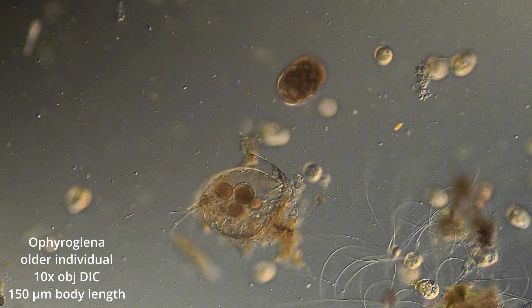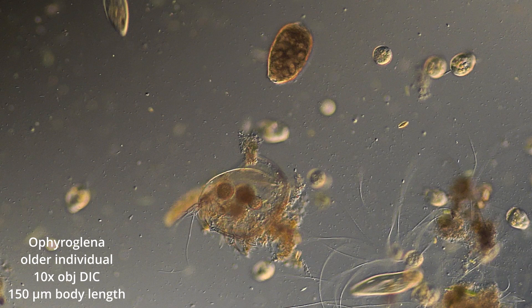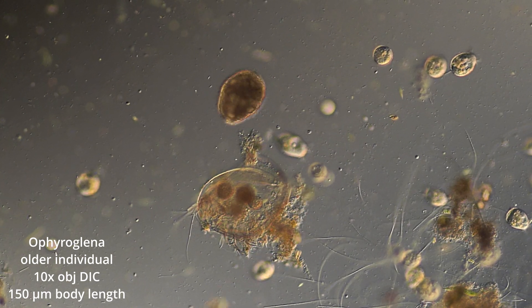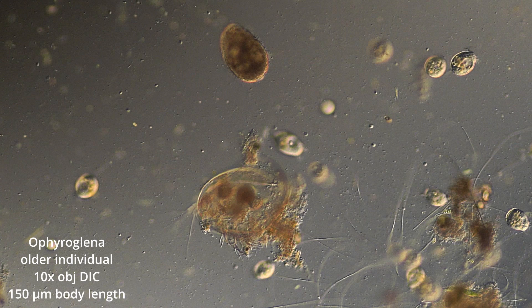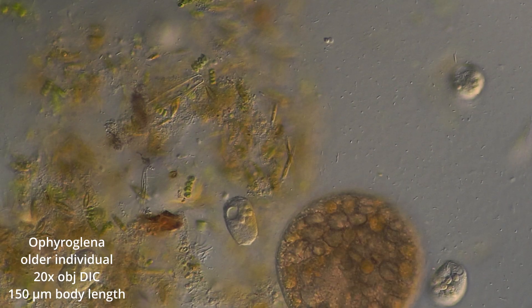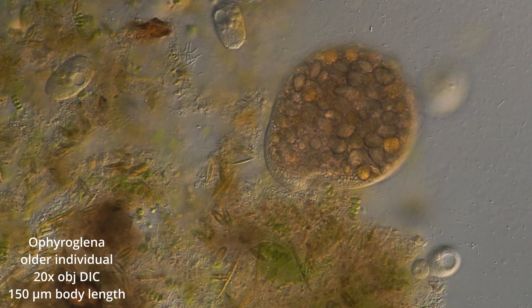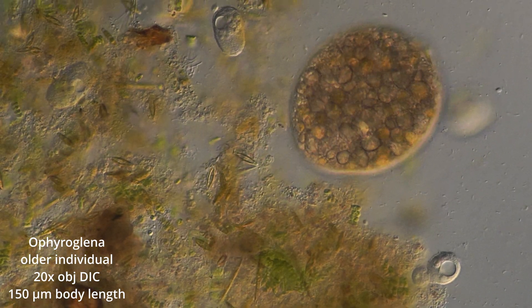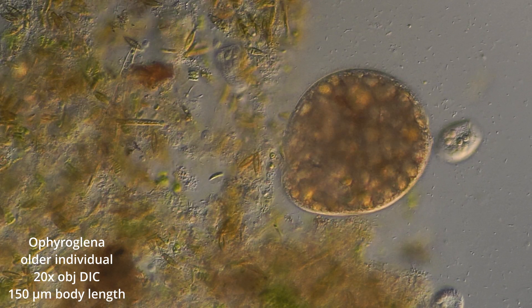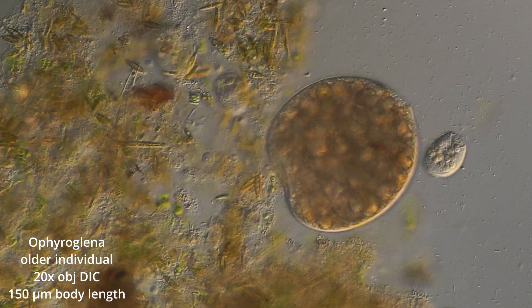They have a sensor near their mouth which is apparently light-sensitive, and at this late-stage in development, that sensor is not visible. Journey to the Microcosmos has a great video on these, including their different stages of development and how that information was figured out — definitely worth watching. So here we're watching them move around with a 20-power objective in DIC.